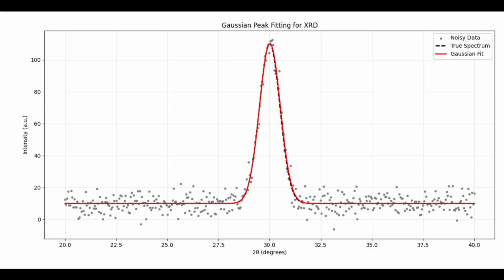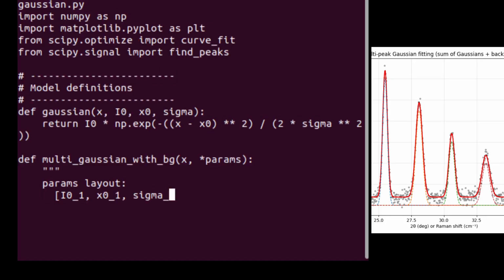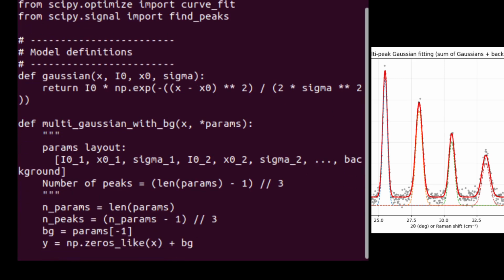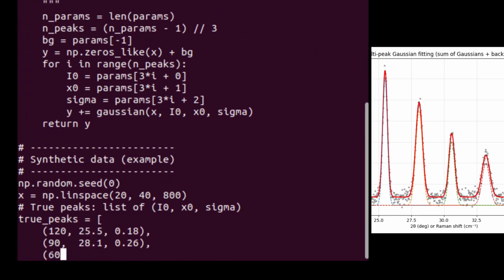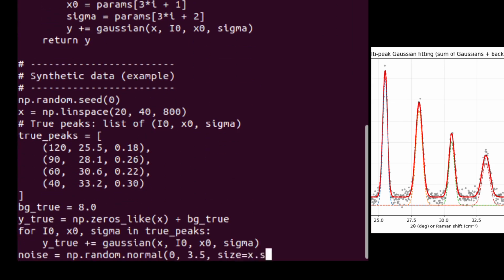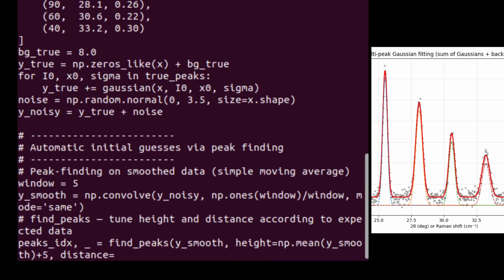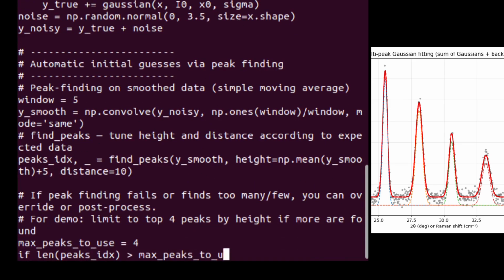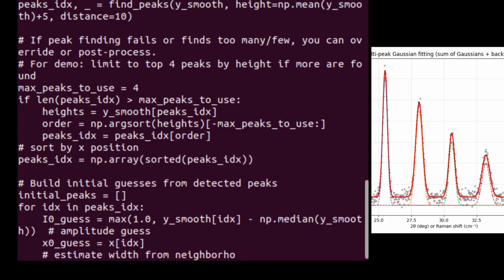Example: fit an experimental peak with a Gaussian or Lorentzian function. Show overlay a fitted curve on data. By minimizing residuals, we can estimate the background, integrated intensity, peak position, and FWHM to a certain degree of accuracy. These parameters carry direct physical meaning in materials characterization.